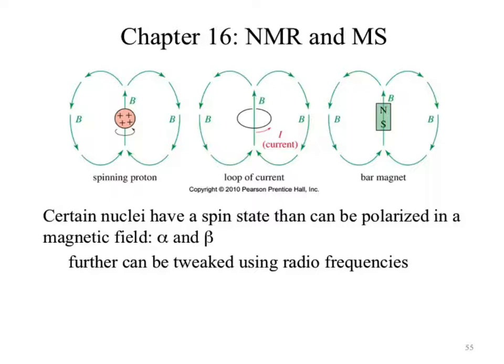to my favorite. In only 20 minutes, we've only got like 10 slides left, so not bad. NMR, okay? And ignore that MS statement up there, because now we're just looking at NMR. Okay? NMR, nuclear magnetic resonance. So we're looking at a nucleus, and we're making the statement that that nucleus is now magnetic. Turns out it is. Okay?